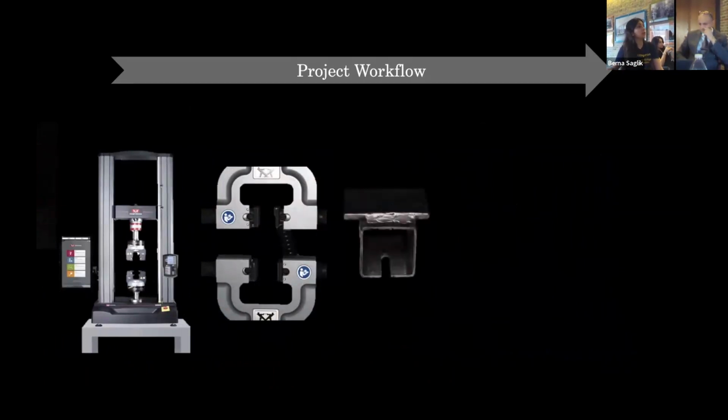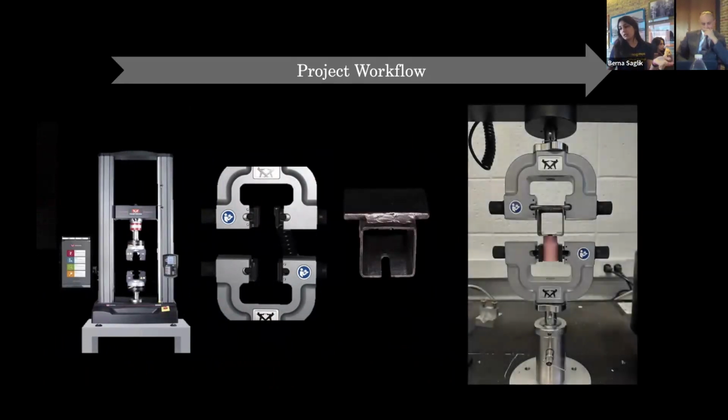We ended up doing a custom-made jig that is very precise to our coping over here. As you can see, that slot is where the coping gets in. That's why we also left those 1 millimeter, because it slides in there. And then for the pull-off test, I'm going to show you how it's mounted. When we do our pull-off test, we're just loading those 2 extensions.